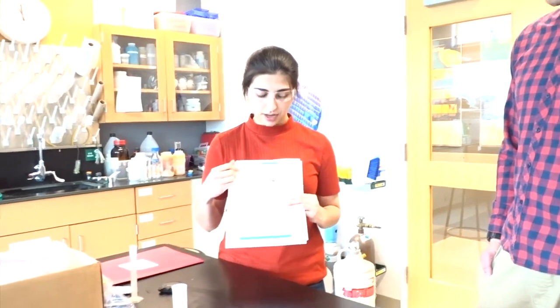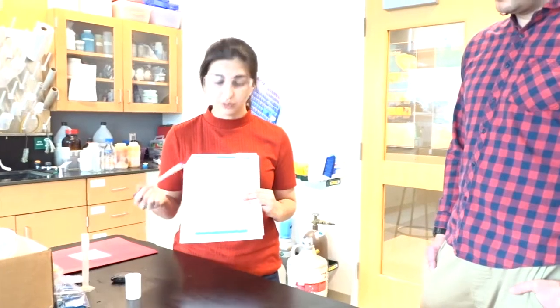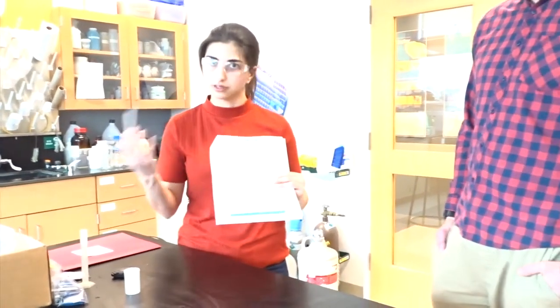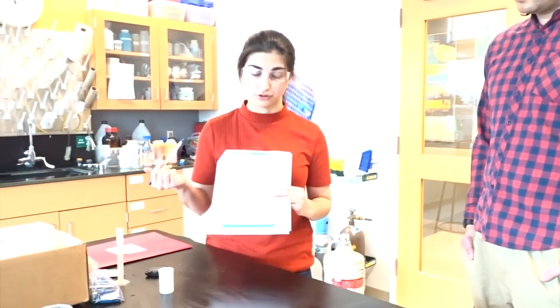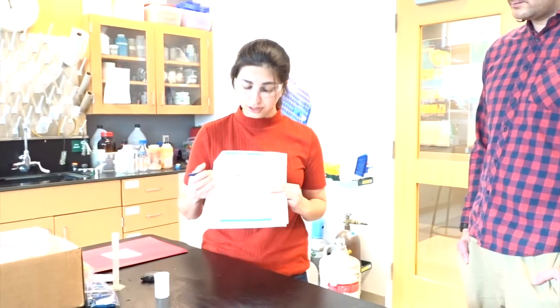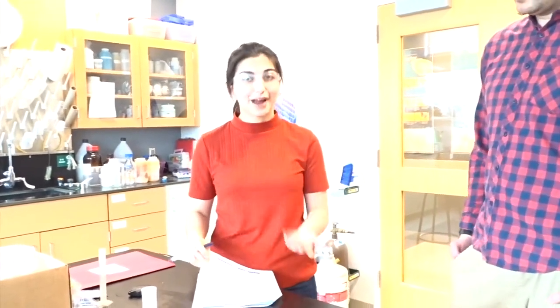And here are some observations that we noted. So for the solid, the second trial was 67 seconds, and that was a little long, so we made a note that it was a little longer than the other 2 trials. And for the crushed, there was a trial that was a little longer than the other 2, so we also made a note that there was some gas leakage in that trial. Once the students have filled out their table, they'll have an opportunity to graph their results.